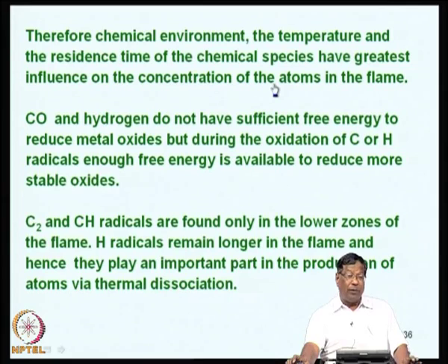This we have to understand, because all we are interested in, in atomic absorption, is the concentration of ground state atoms in the flame. The other components, like carbon monoxide and hydrogen, do not have sufficient free energy to reduce metal oxides. You can look up the free energies of such species in standard chemical tables in textbooks, etc.